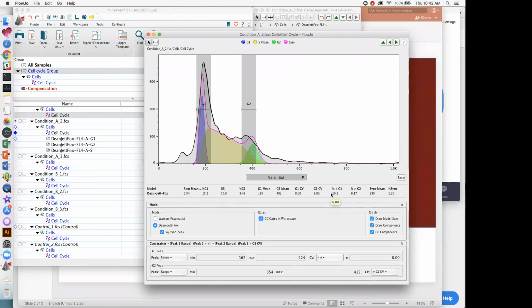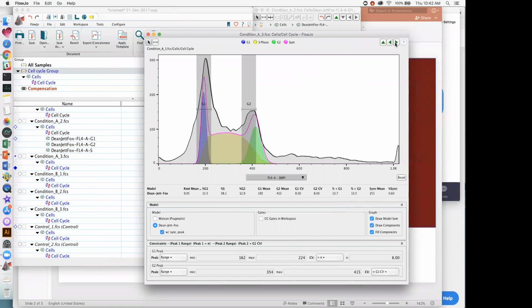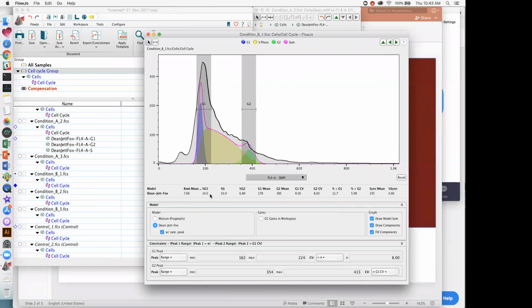So that the model doesn't equal 100% is not critical. It's not a problem. It's just a matter of the constraints that have been applied to the model. So in some instances, you'll see that it gets closer to 100%. Other times, you'll see that it falls well short of 100%, and not to be alarmed, it's just how the algorithm works, and there's nothing we can do to really increase or decrease that without changing the model in its entirety. And so, for example, here again, we're falling short of that 100% easily within the first three phases.